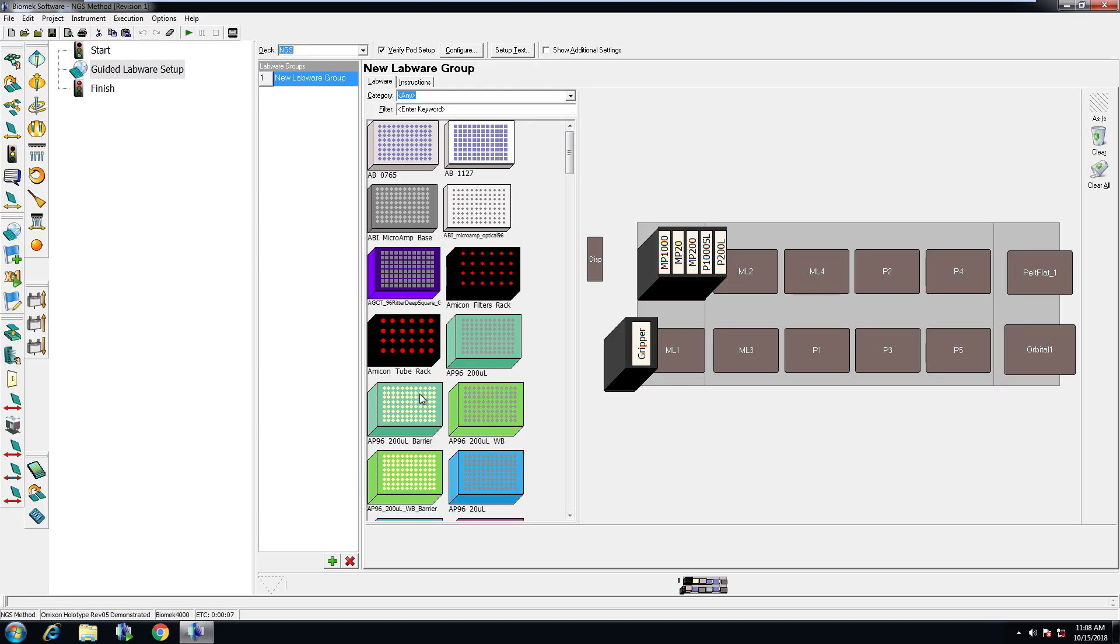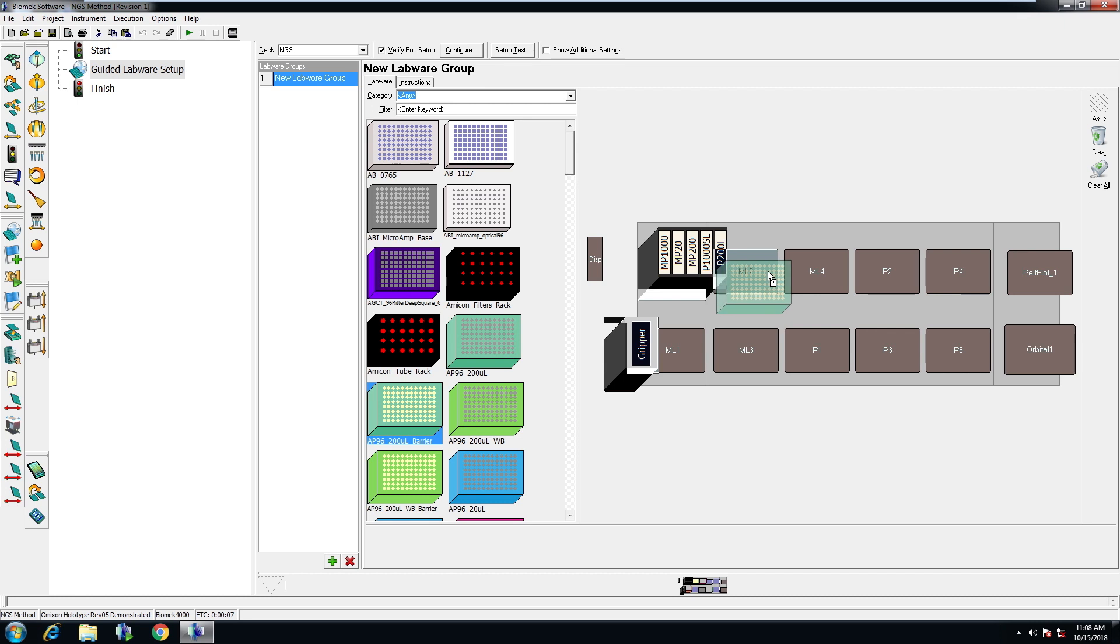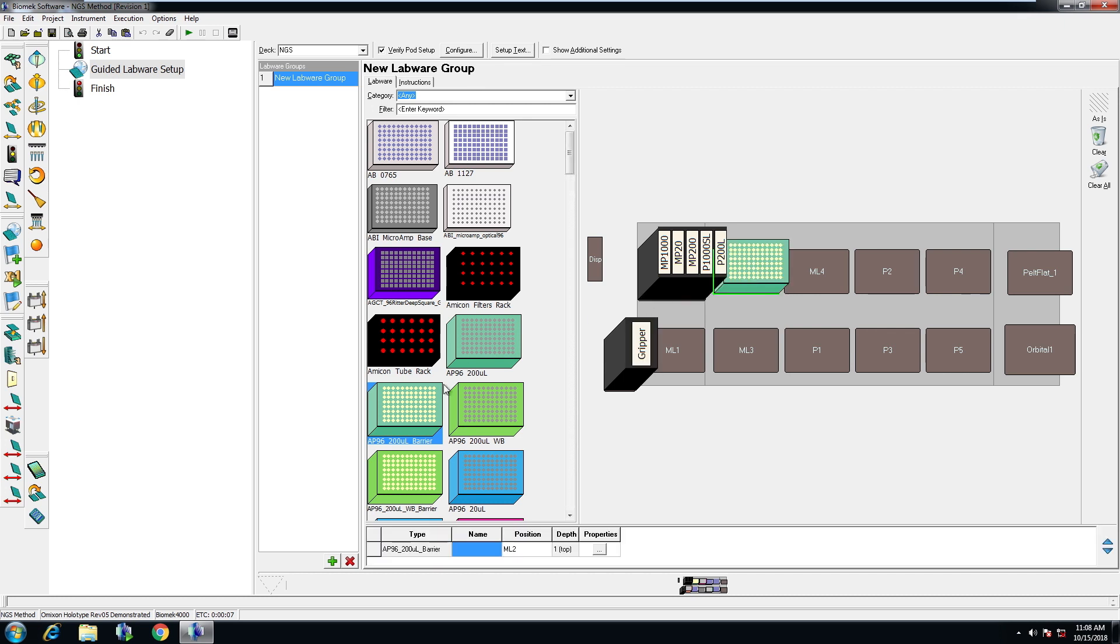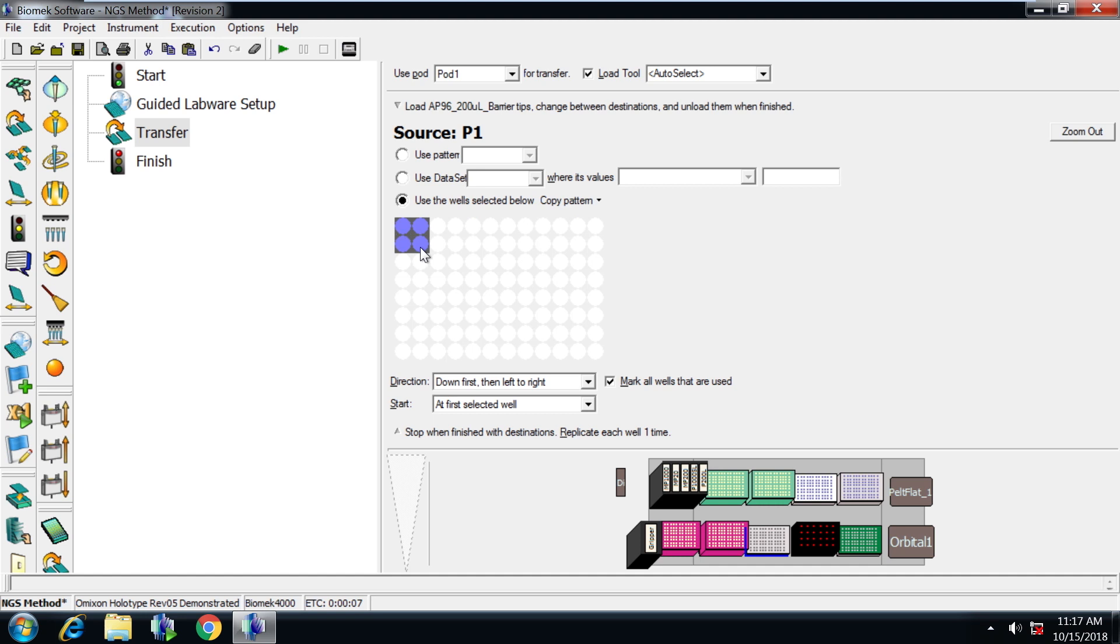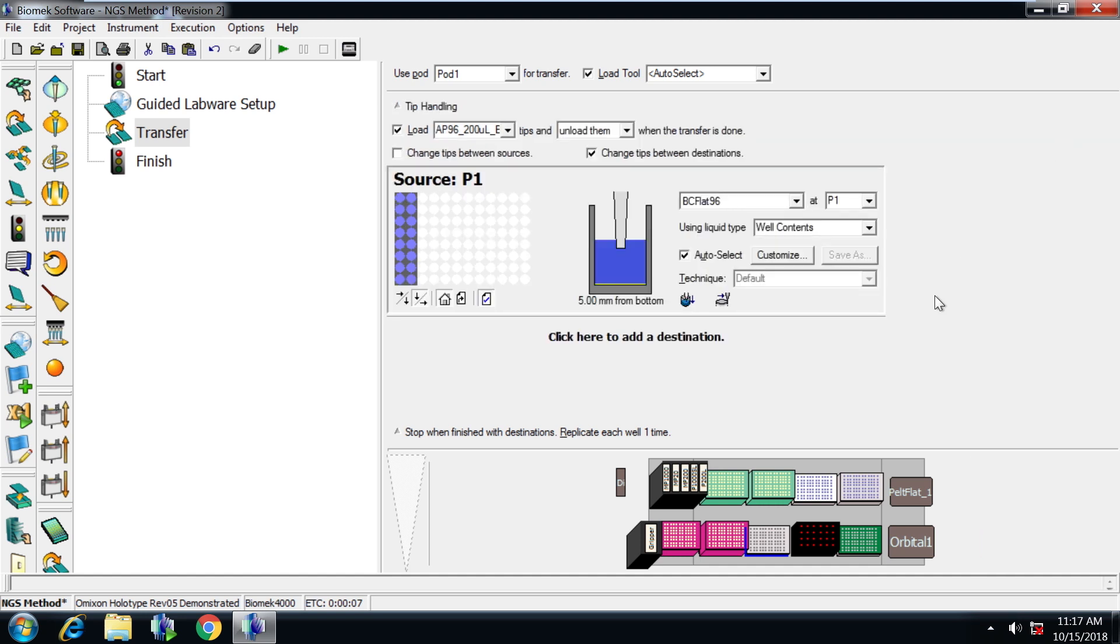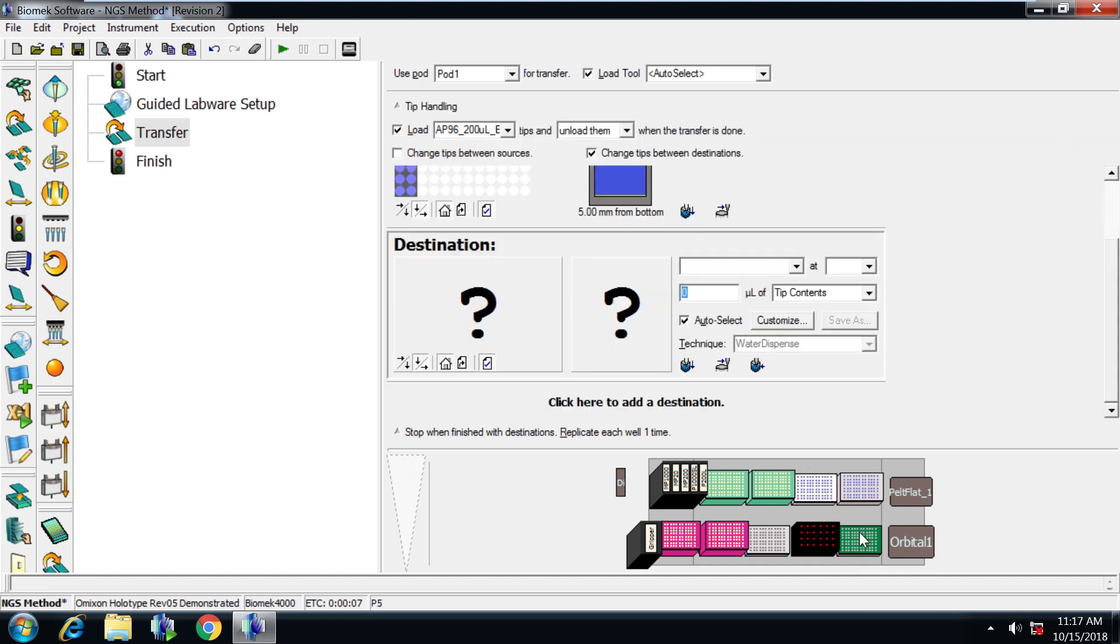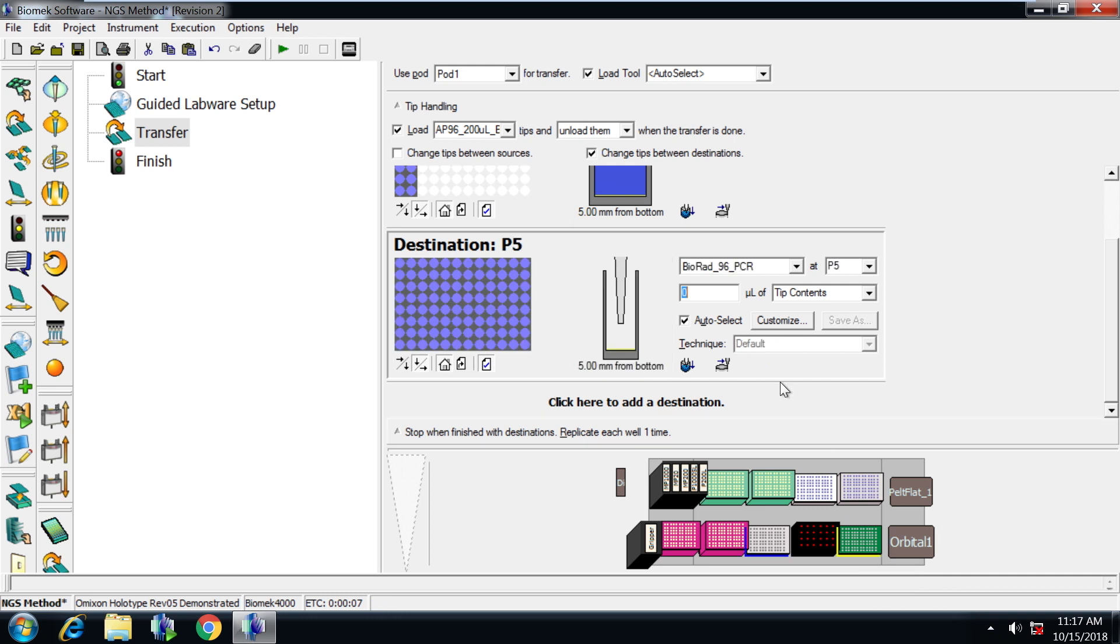At the heart of every Biomech is its software. Whether you're a first-time automation user or a seasoned professional, the intuitive simplicity and power of Biomech 4000's software make it easy to set up, edit, and run even the most complex applications.